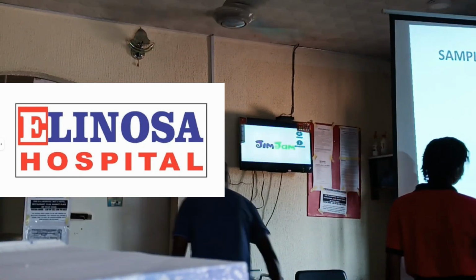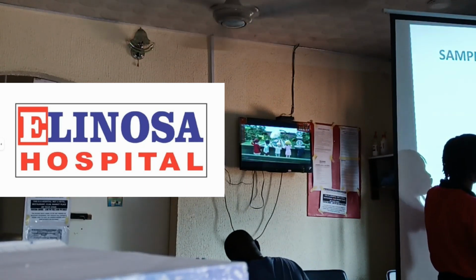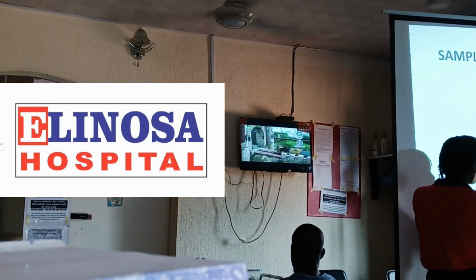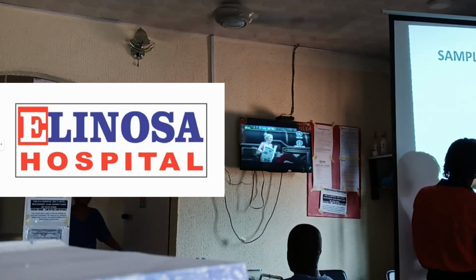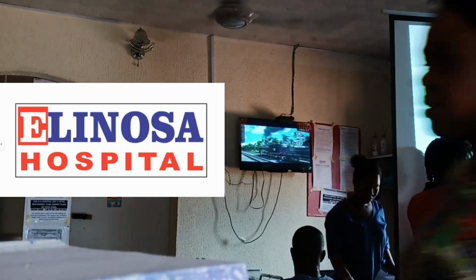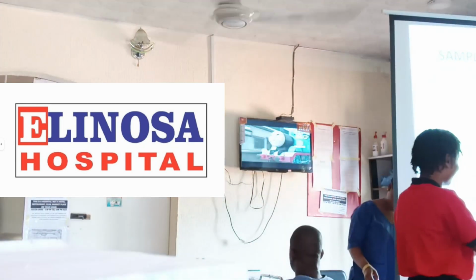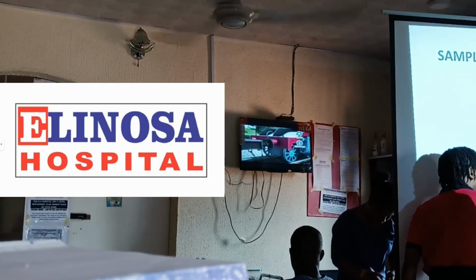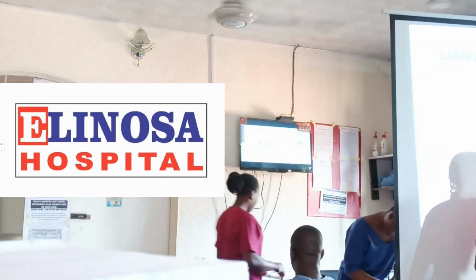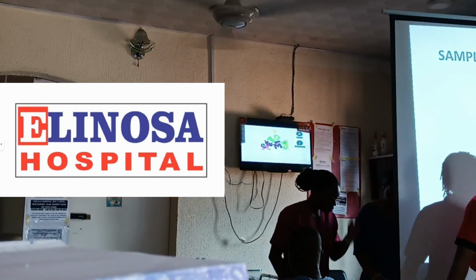If it is a stool sample, like I said just now, you need to tell the patient not to fill the container to the brim. Just collect a small portion and put it in the sample container, not the one where they press it down until it is full. You only need a little portion. Then this one you bring inside the refrigerator. Then these are other sample containers that you can actually use to store your sample.